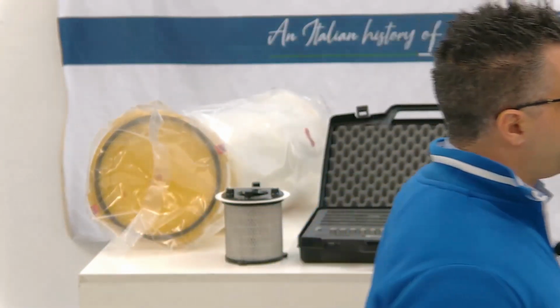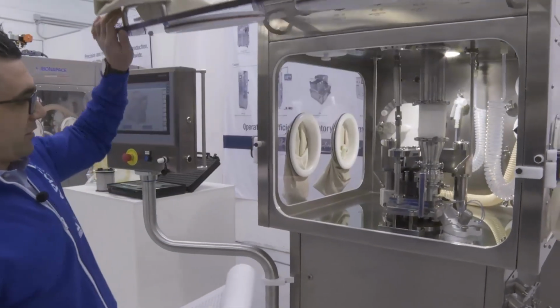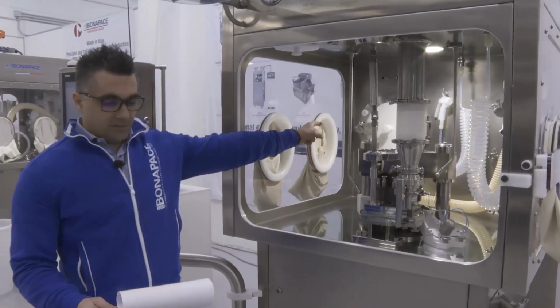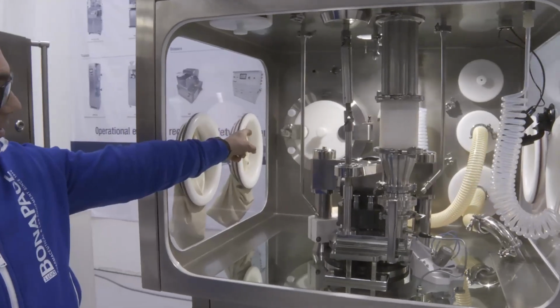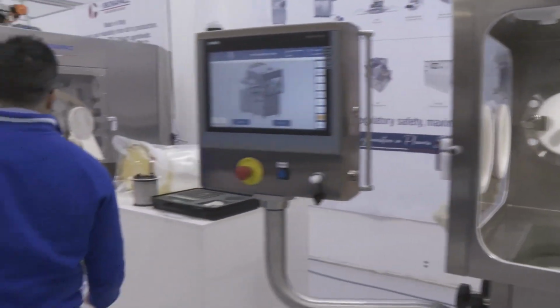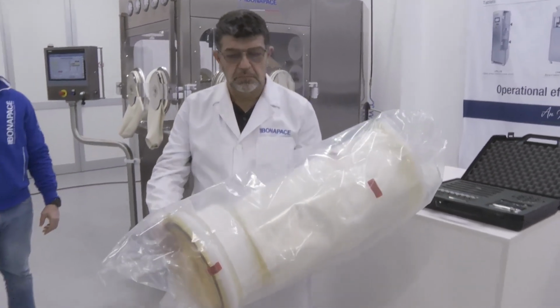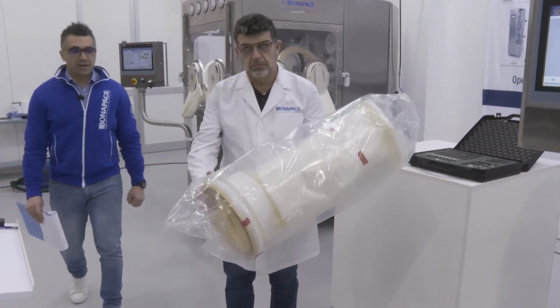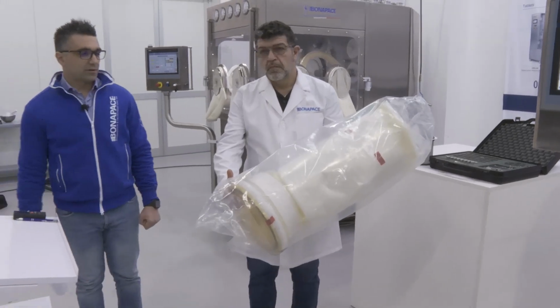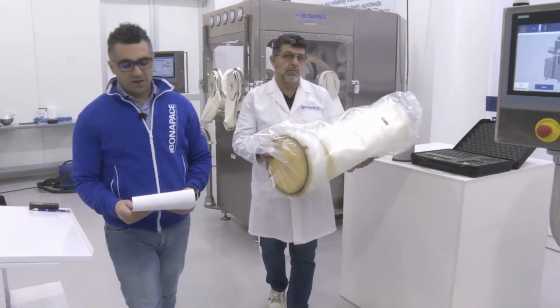The current setup includes an RTP port, positioned in that part of the isolator, and the continuous liner that the operator can apply in the back part of the isolator.